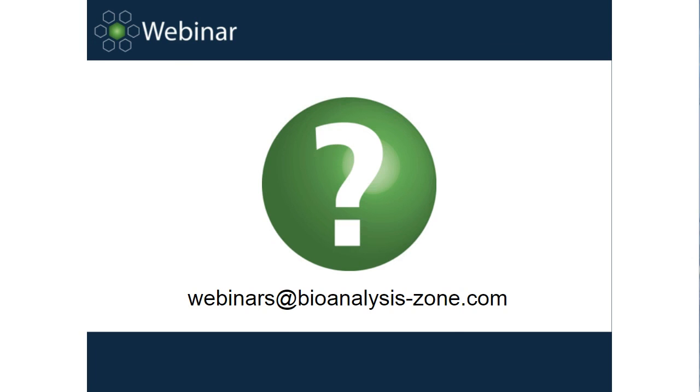Okay, and what kind of affinity would be expected in general for antibodies from phage display? So with our library, it's pretty good, but what I would say is it depends on the stringency of the library screen. If it was simply, here's a protein, generate an antibody to any part of this protein, within the library you'd have a very large number of antibodies which recognize the different epitopes on the protein, so there'd be a lot of competition and the higher affinity binders would win out. So in that case, if it was literally here's a protein, we'd expect single-digit nanomolar affinity, or maybe even sub-nanomolar. It's really quite good for our library.